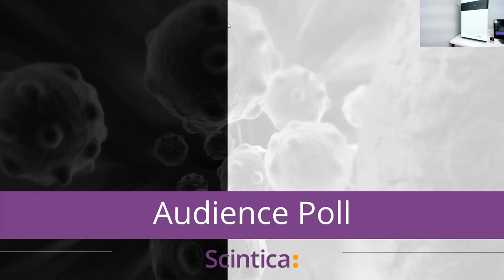Yeah, so that's exactly what I showed within the software, the image of the Western blot. So it captures Western blots using chemiluminescence, and you can also capture through fluorescence in the visible and the near infrared spectrum, and you can also capture colorimetric Western blots, which are already visible on the membrane using the color imaging function.